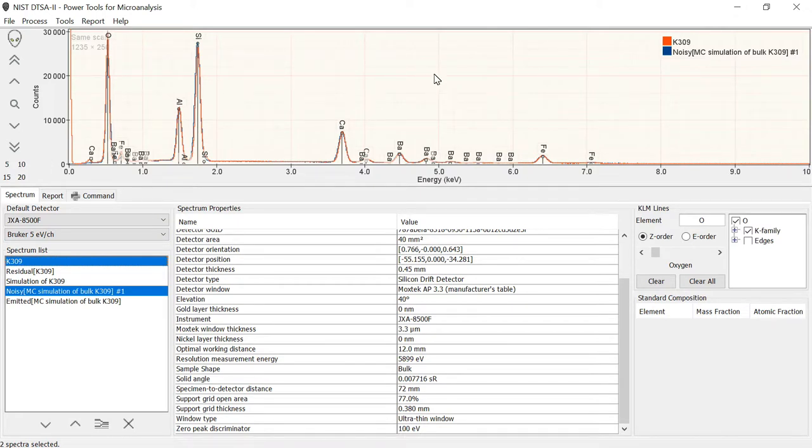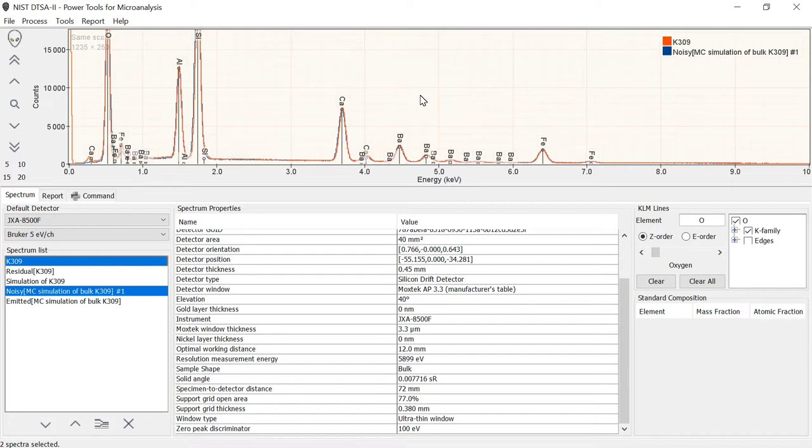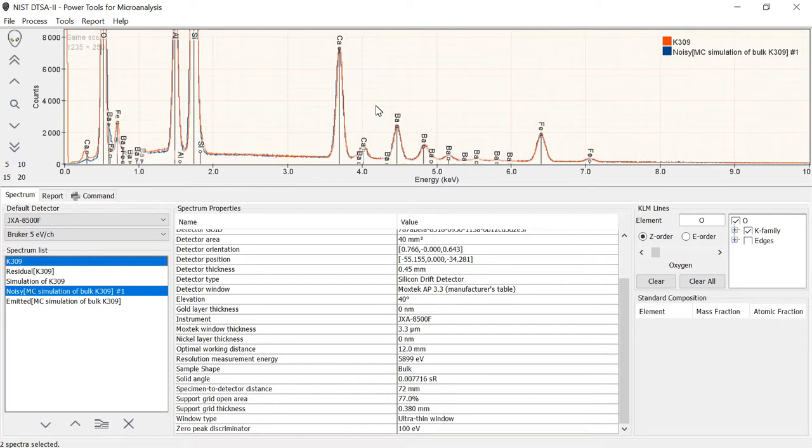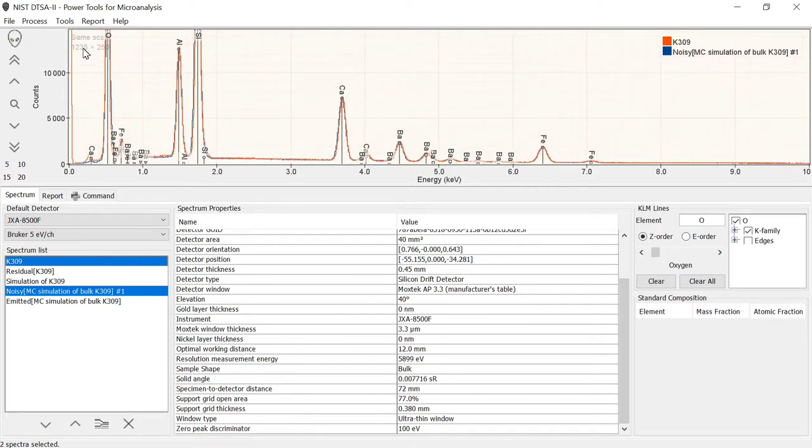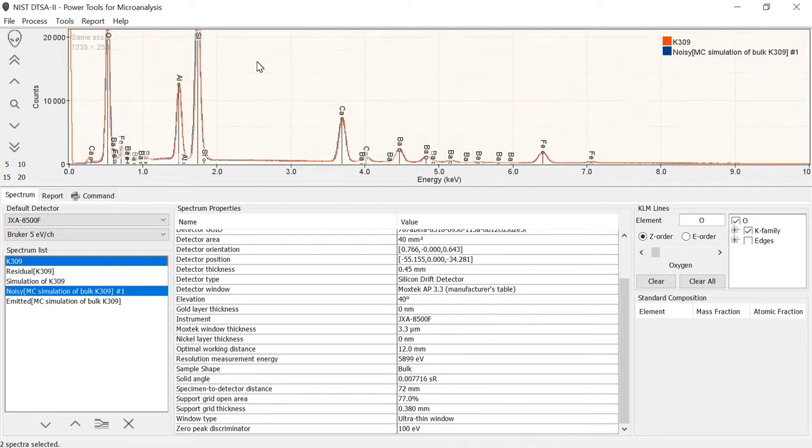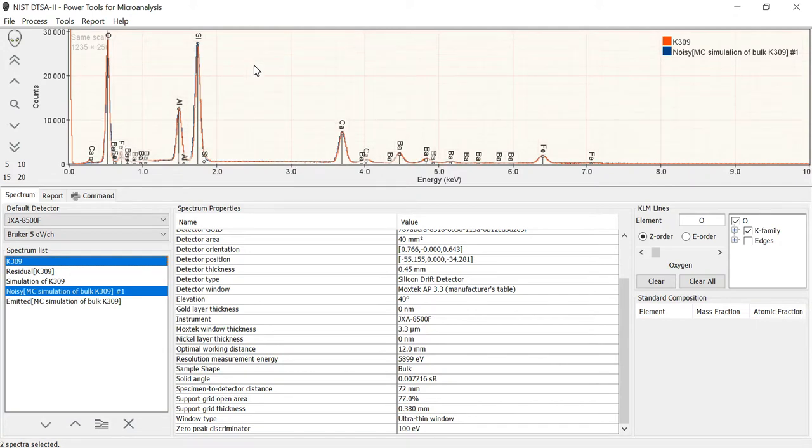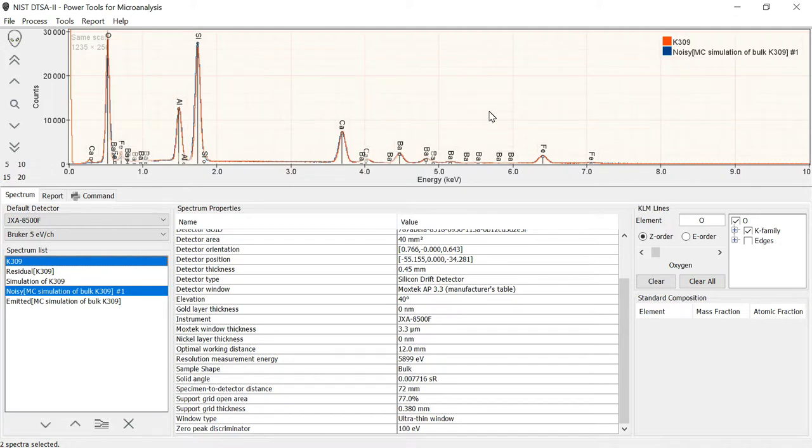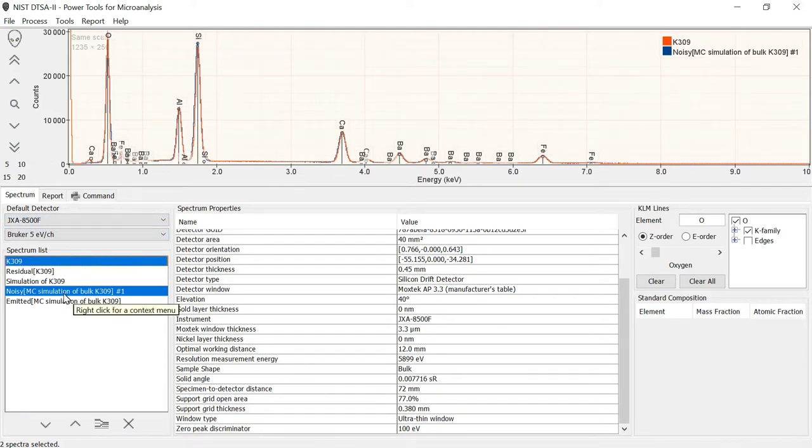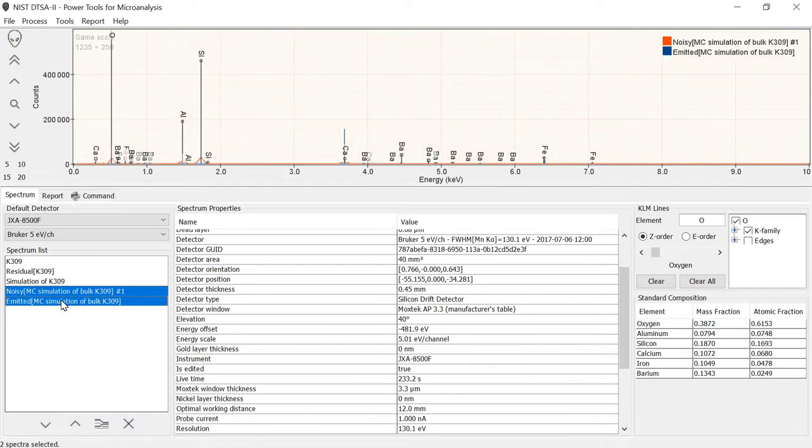Probably more interesting is this one called Noisy MC Simulation of K309. And we can compare that with the measured spectrum. And again, we see really very good agreement between the simulated and measured spectrum. You'll notice in the upper left-hand corner it says the same scale, which is to say that these are not being renormalized relative to each other. This is a result of everything in the software being set up correctly and shows us that we are capable of simulating spectra very reliably.